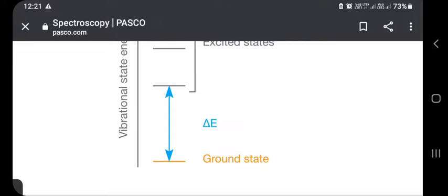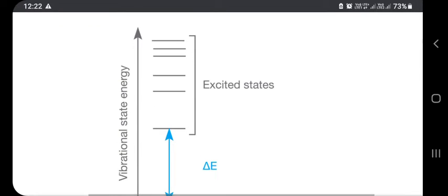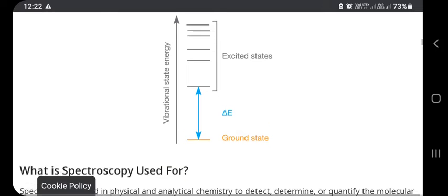Absorption lambda maxima is the wavelength and wave number of radiant energy absorbed by the molecule, after which they go to the excited state. Within the excited state, the excited molecules will have different configurations that correspond to a particular molecule and its behavior.